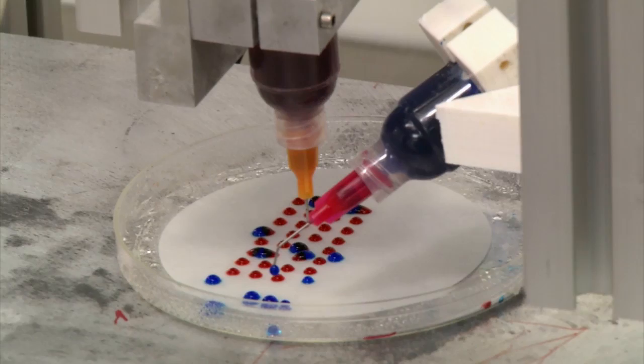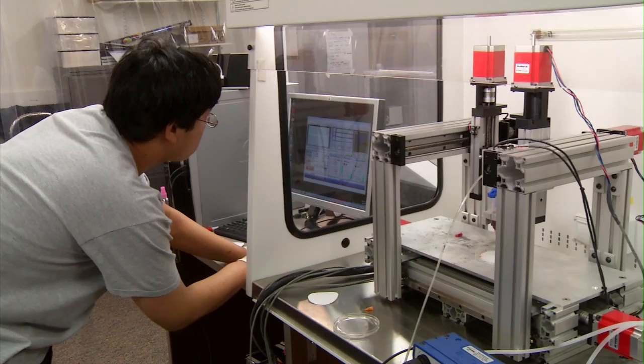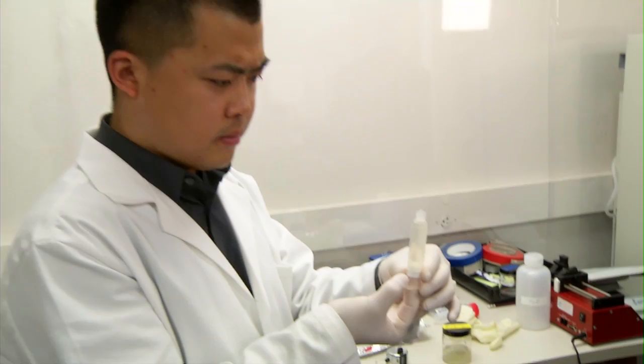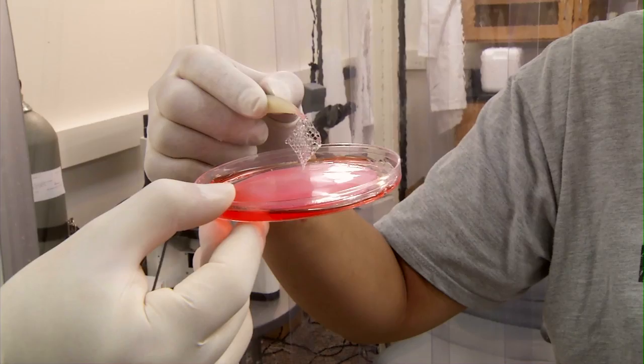Printing body parts may sound a lot like science fiction, but it's possible, and it begins with the printer, which is a lot like a traditional desktop printer or a 3D printer. And it all starts with the ink. With the bioprinting process, we replace traditional ink with bio ink, which is a solution made of biomaterials and living cells. And then we print them in 3D.